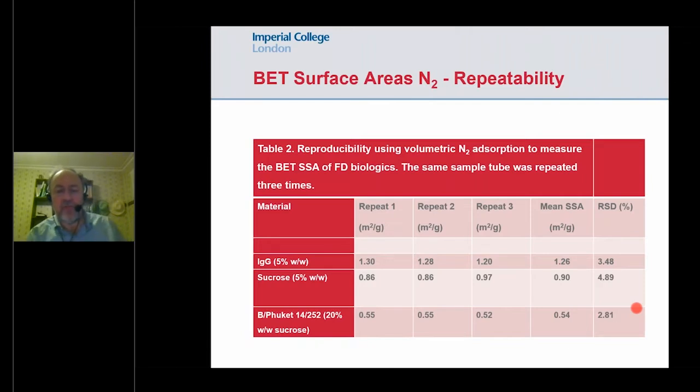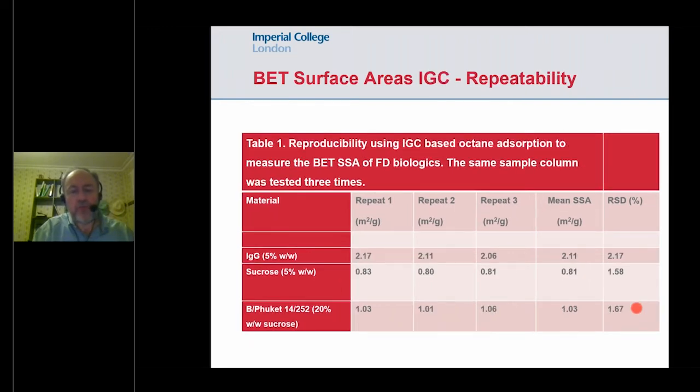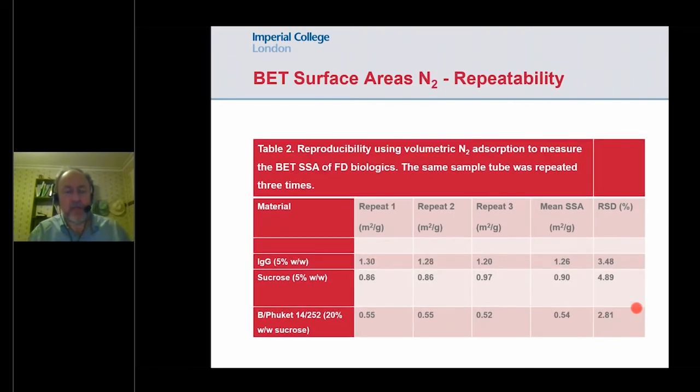And this is the reference method. This is the standard technique that most people would normally use, which is nitrogen adsorption at 77 Kelvin. Don't worry too much that the results don't agree. We'll discuss in a moment the fact that there is quite a bit of vial to vial variability. So if you've got 1,000 vials and you draw 2 vials out, they often have different structures and different surface areas. That is not a manifestation of the measurement, it's a manifestation of the manufacturing process, which is not always as good as you'd like.